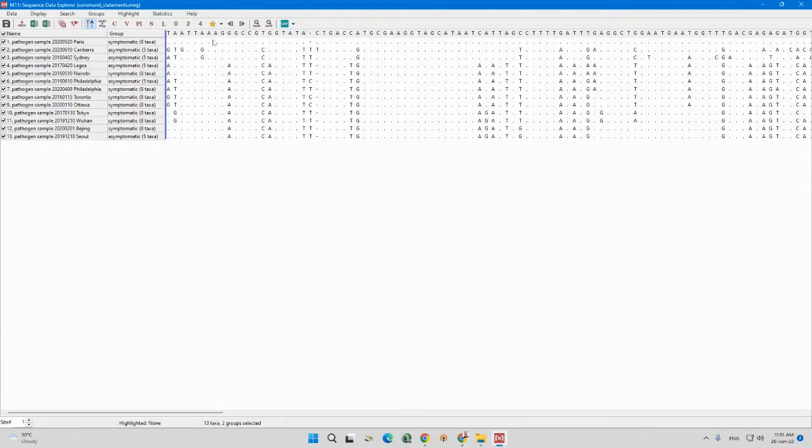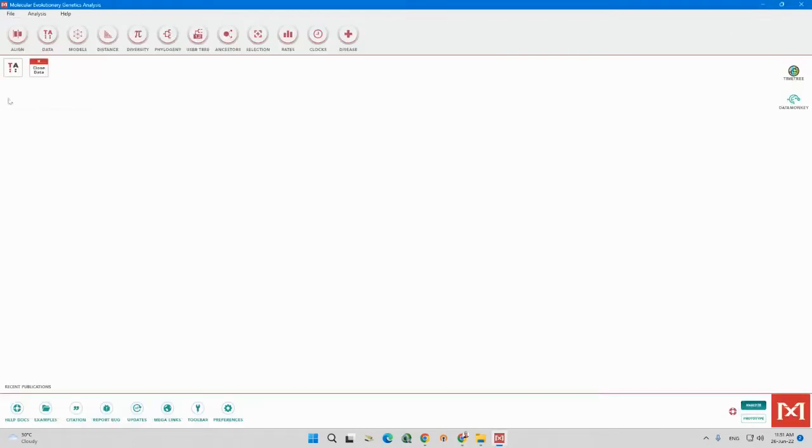See, these columns, dot dot dot, are constant characters actually. This character has two character states. Here it has A and dot. So this character has two character states, as I explained before. Just have a look at it and then minimize it. This is an active data set.